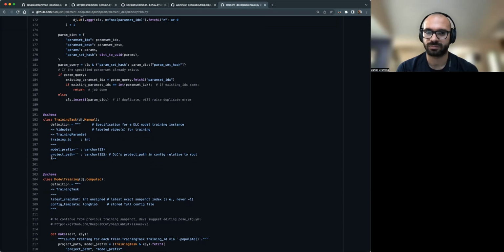So using the suffix task, training task, I think it's called PoseEstimation task, you're manually pairing two foreign key references and then giving it a unique ID within that table in order for your populate command to run overnight on each of 20 different IDs, whatever it is.